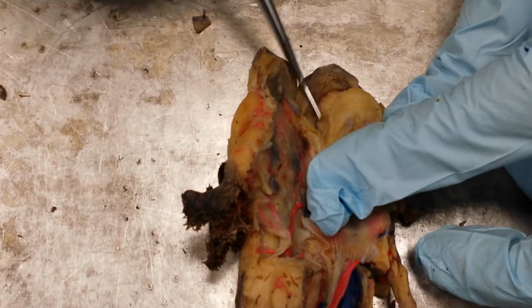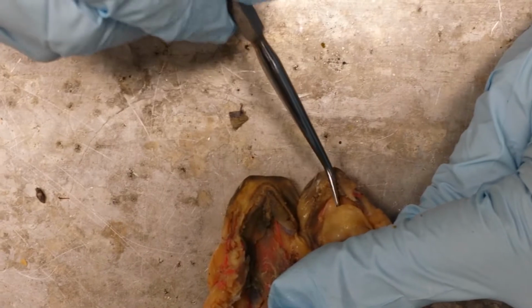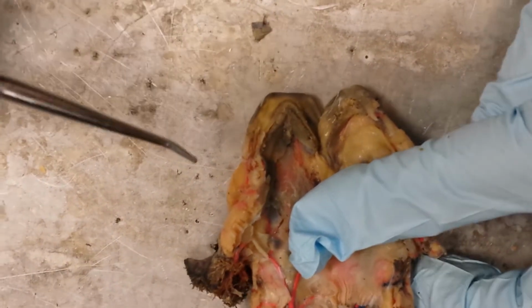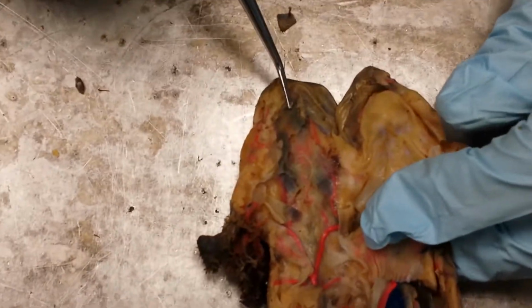You're going to notice that there are two strings of bone that run at the tip of the mouth here, and they have serrated teeth on them. Those are the vomerine teeth. Okay, hard palate, tongue, vomerine teeth.